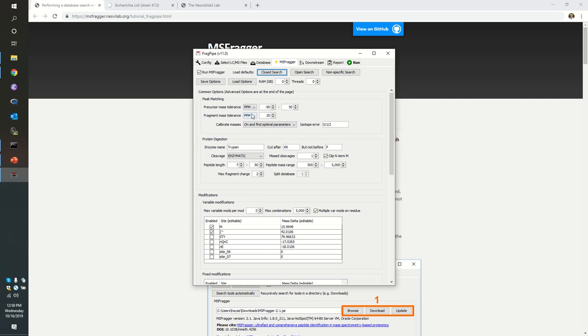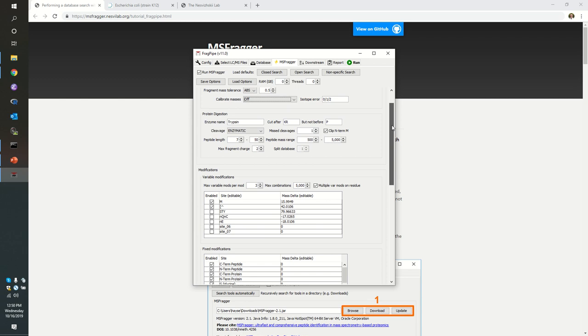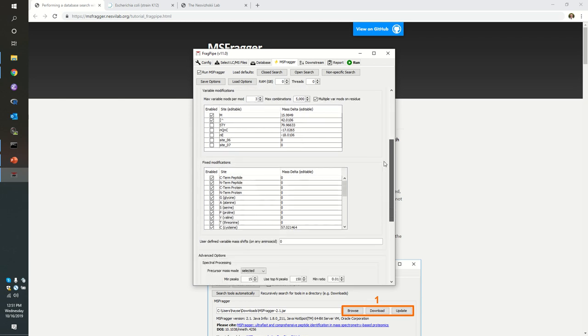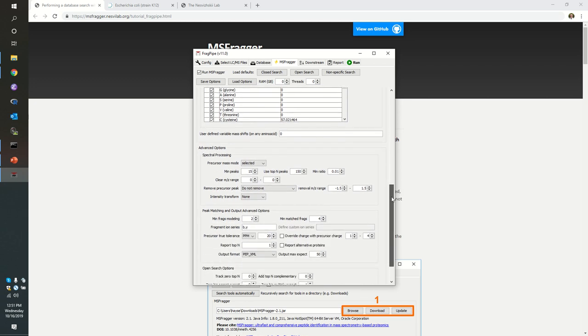Once again, we must remember that in this case, the tandem mass spectra were collected in a low resolution trap. So we need to specify that it has a 0.5 absolute or m over z deviation allowable for fragments. And we're going to continue on with the precursor mass tolerance of anywhere from minus 50 to 50 ppm. I'm going to turn off calibrate masses again.